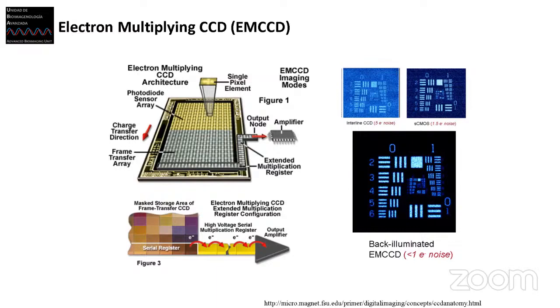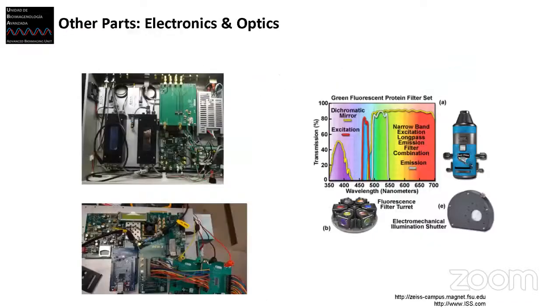And this is the technology that most of the microscopes for super resolution based on camera use, EMCCDs. While I have to say that in the last 3, 4, 5 years, the scientific CMOS are getting so much better, and so much cheaper, and the chips are much bigger, with many more pixels, that they are co-opting the field of super resolution.